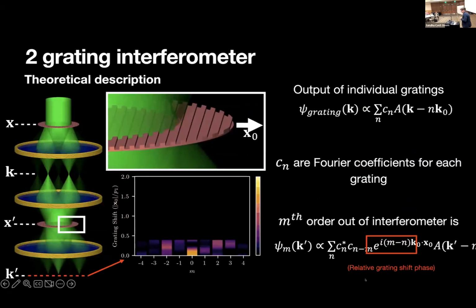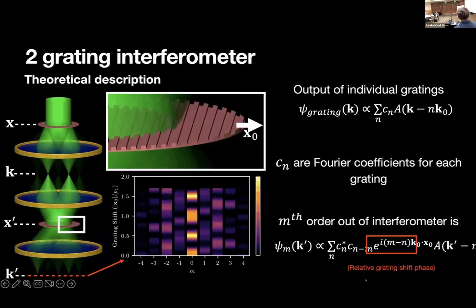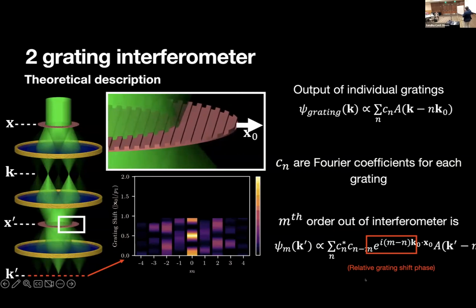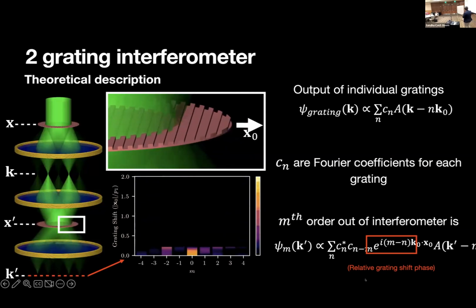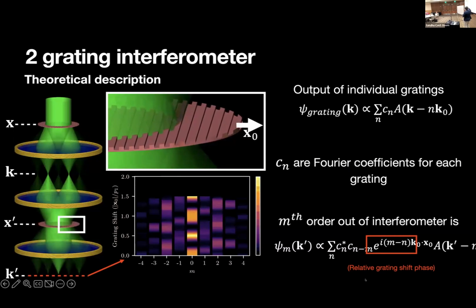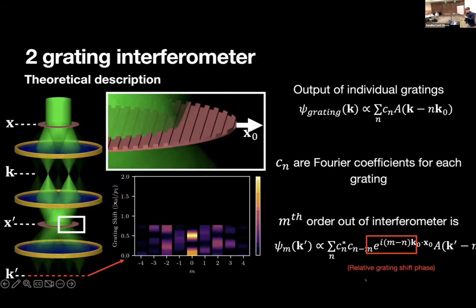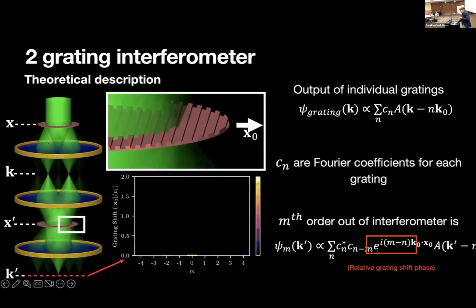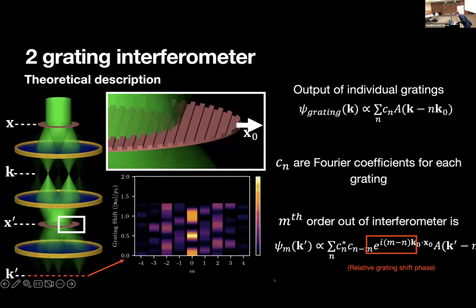Okay, so what we can do is introduce a path length difference just by shifting one of the beam splitters. So here's us shifting the second grating beam splitter and looking at the various outputs. You'll see that we don't just get 2 equal intensity outputs. We get something more complicated. However, if we call this a bright port, then we can see that when it's bright, there's another port that's dark. We've done this in multiple ways. We can use blaze gratings to get interference between the 0 and +1 diffraction orders. So we can tune this asymmetry a bit.